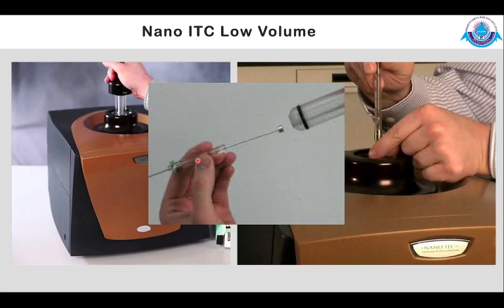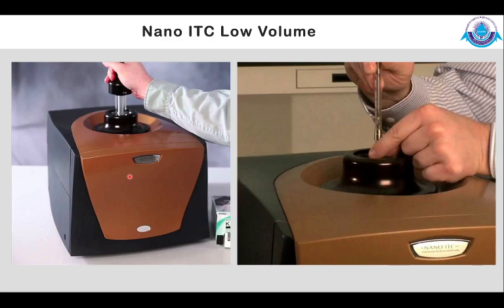We fill the micro syringe with the inhibitor molecule and attach it to the piston head. Then the piston goes back into the equipment with the needle. The needle also contains a small stirrer that will be used to stir, and the whole thing is connected to the computer, from which all the parameters can be controlled.